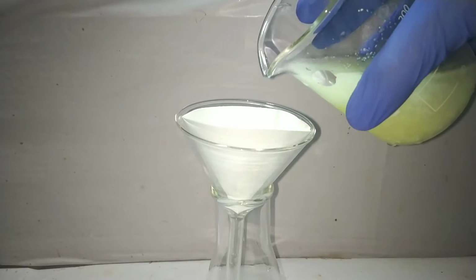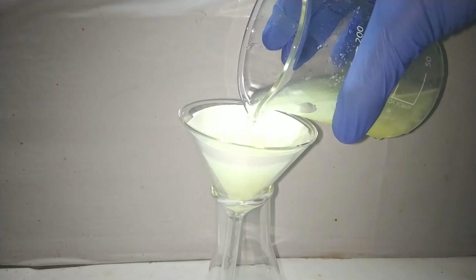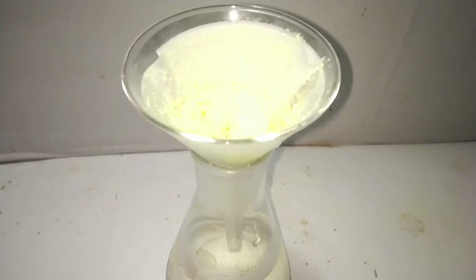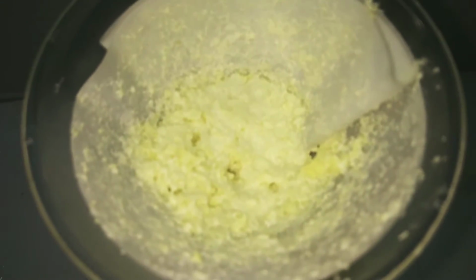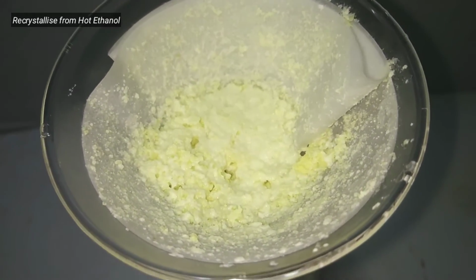Now filter the solution by the simple gravity filtration method. And then after filtration, we will wash the crude precipitate a couple of times with distilled water to remove the excess traces of acid present in it. Finally, allow the precipitate to dry on the filter paper, and this is the crude Benzil.